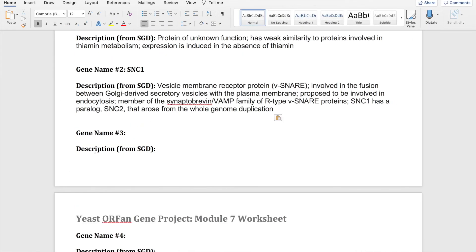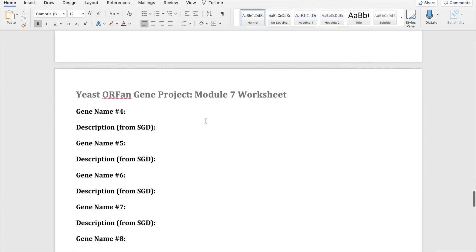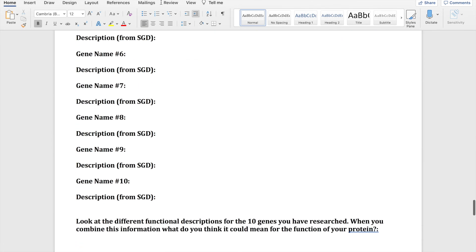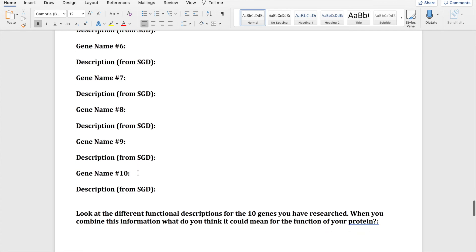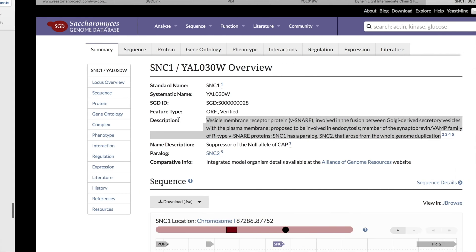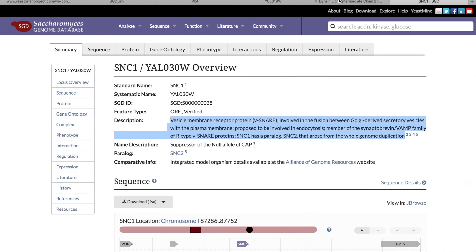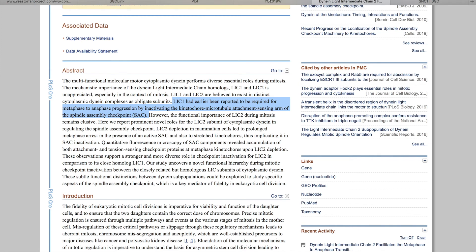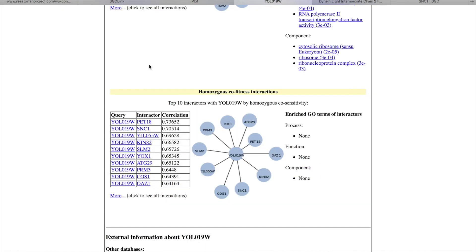So you're going to want to go through and do this with all of the different genes that show up. Writing down the name, searching the description, and copying and pasting it, one through ten. And then you're going to want to read through the descriptions, figure out anything that you don't understand what it means, and then put together what things are occurring again and again and commenting on that at the end of the question section.